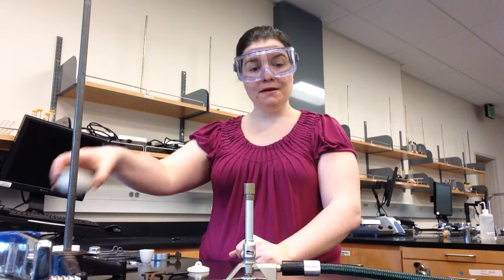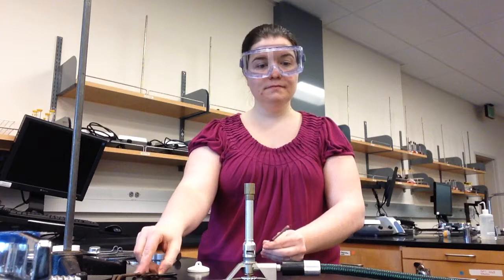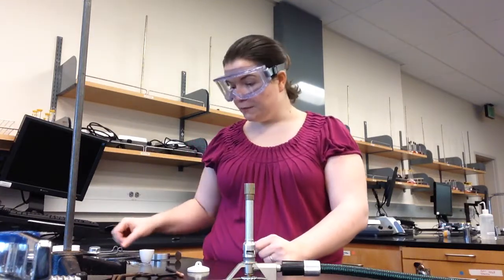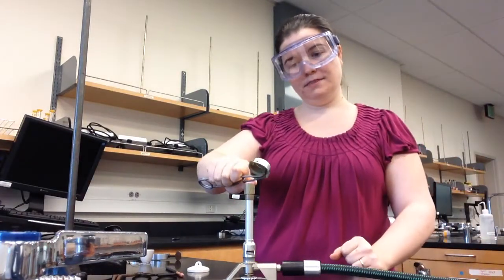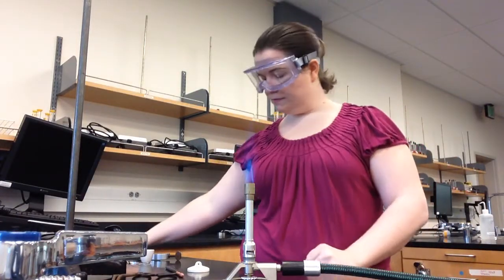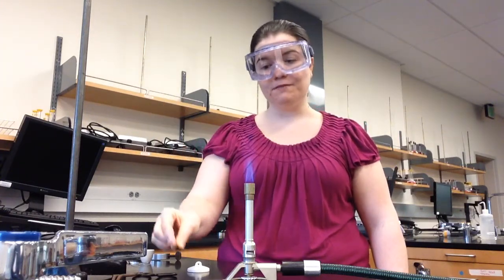Part 1 of this lab involves determining the relative temperature of the Bunsen burner flame using a nichrome wire, which you'll be able to find on the cart, and a piece of copper metal. To start this part of the experiment, you will need to light your Bunsen burner using a striker, and you'll put the nichrome wire in different parts of the flame and observe what happens. Determine what the hottest part of the Bunsen burner flame is.